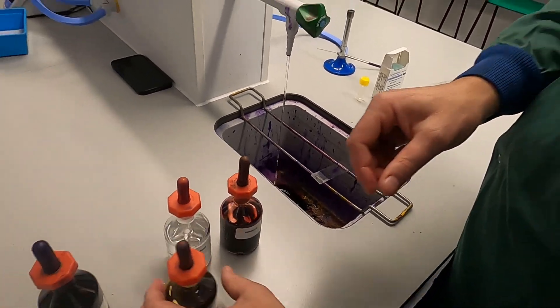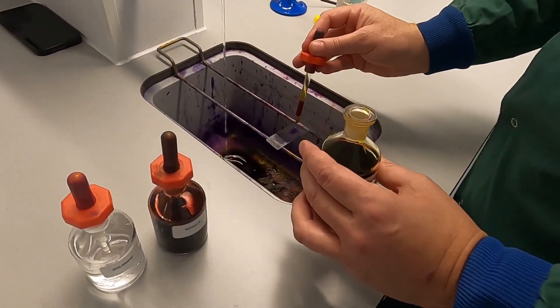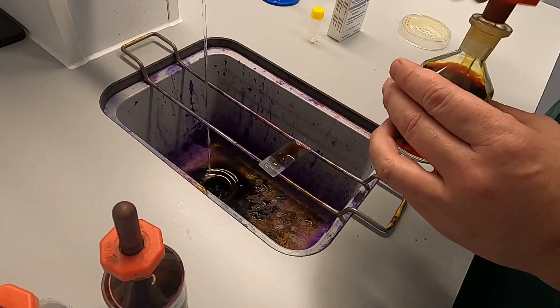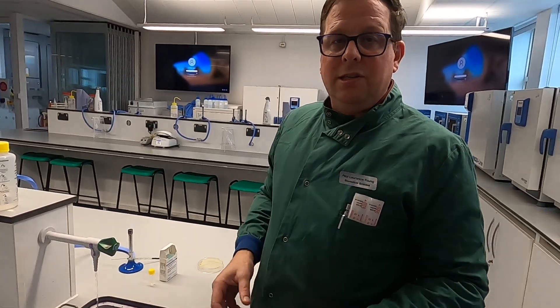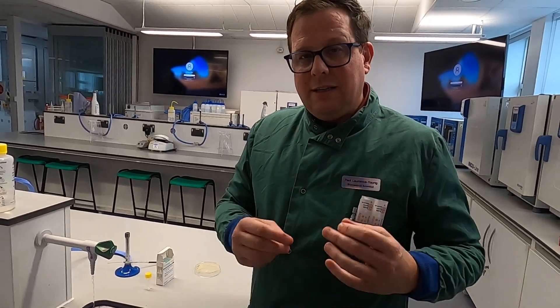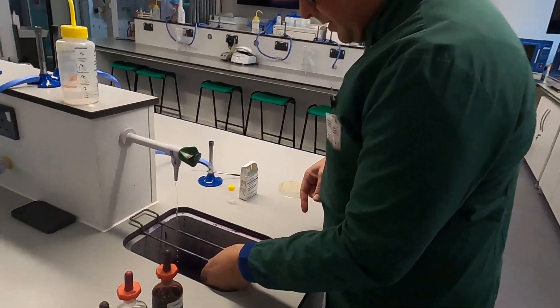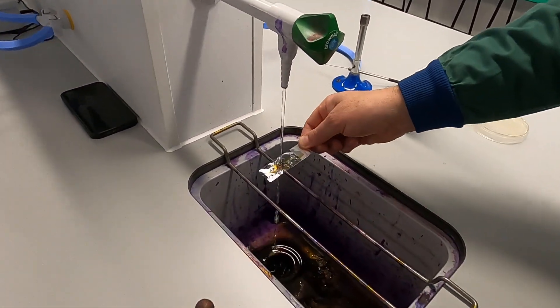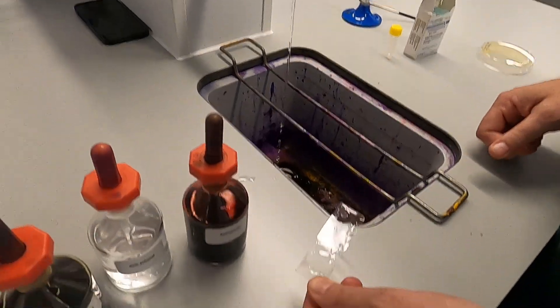The next thing you do is apply Gram's iodine. It will go from purple to black almost instantly. Again, leave it on there for a few seconds and let it do its business. Just like with the crystal violet, it doesn't need a long time. So you tip that off, give it another rinse, and you'll see it is now black.